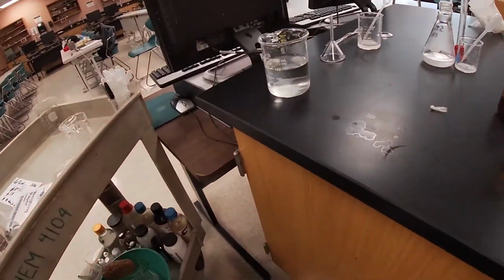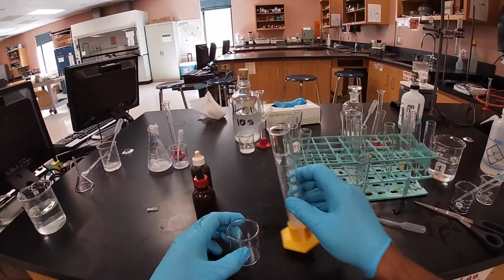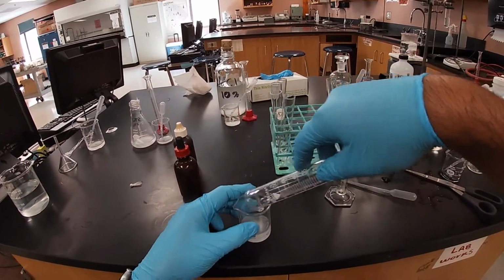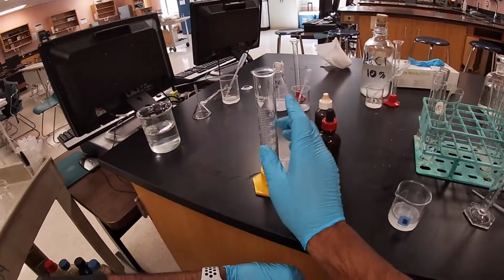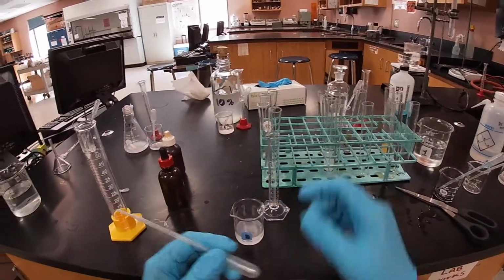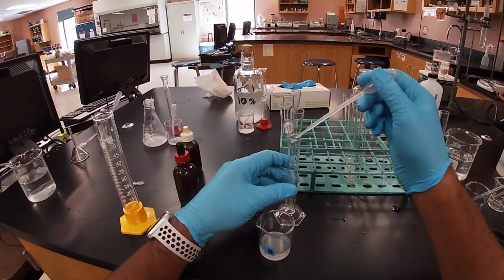We're gonna get a beaker, and in this beaker we're gonna drop our contents, which is our 15 mLs. And once we drop our contents, now we're gonna measure out our 5 milliliters and test the inside contents.